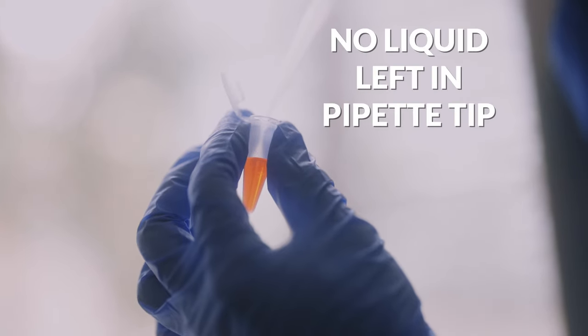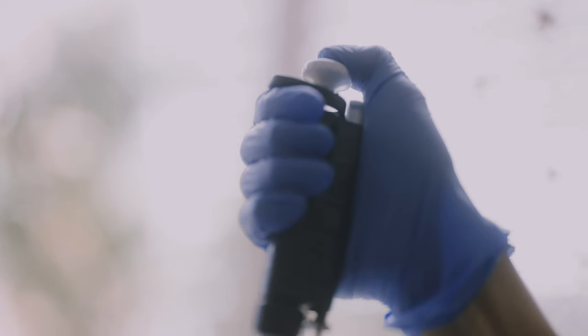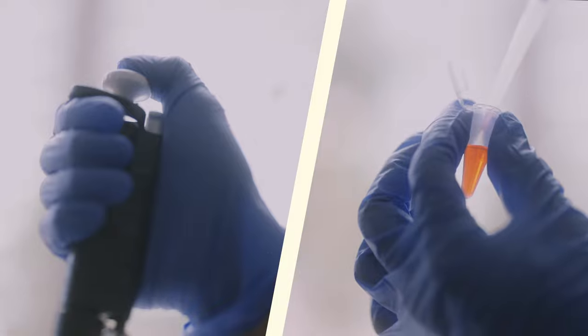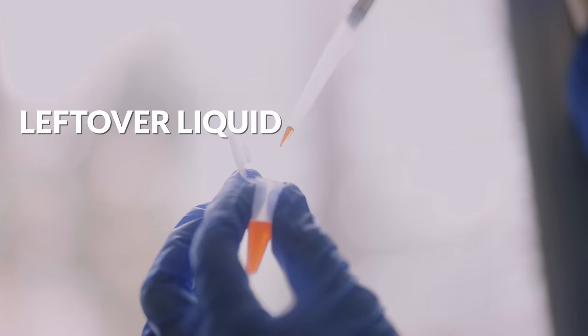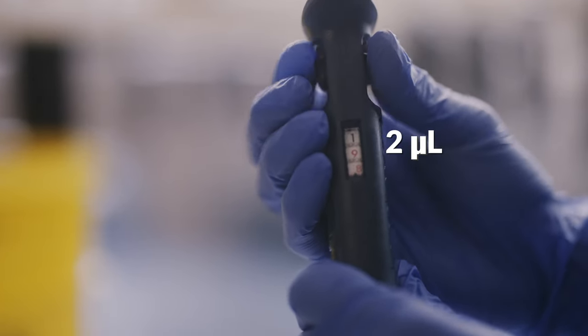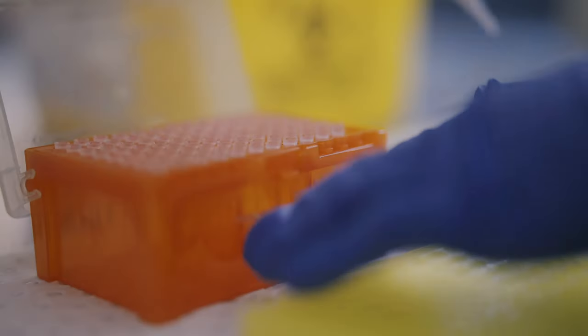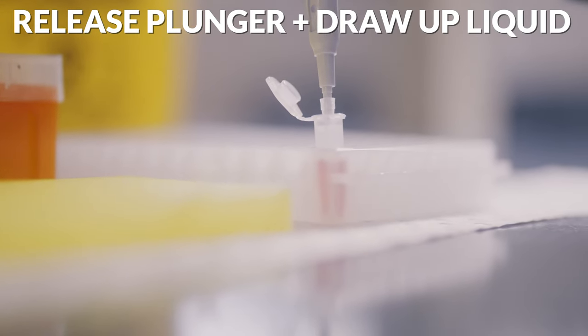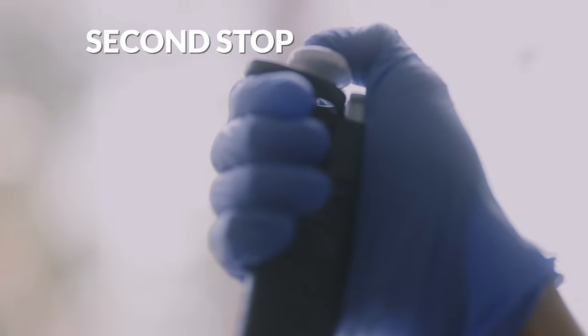This is where a lot of the confusion and inaccuracy can come in. Some people push past the first stop before drawing up liquid, so they are drawing up more than what they want. Some do not push past the first stop when dispensing liquid, constantly leaving behind some liquid in the pipette tip. When you are done, eject your tip into a sharps bin by pressing down on the tip ejector mechanism. These differences are easy to visualize for a relatively large volume in the P1000 pipette. When we go down to a P2 pipette drawing up only 2 microliters or less, it is very difficult to see any minute differences in volume. You'll need to rely on your technique more than seeing changes in volume with the naked eye. Remember to push to the first stop before drawing up liquid, and when dispensing, push to the second stop.